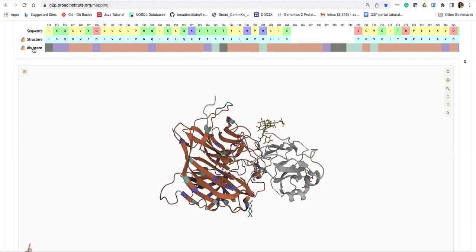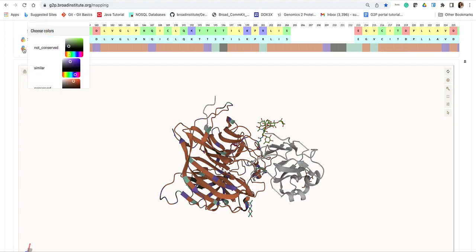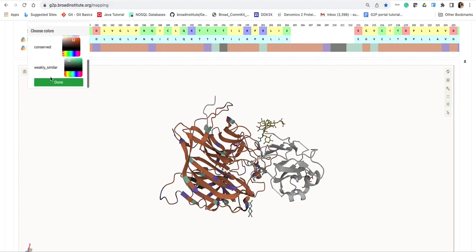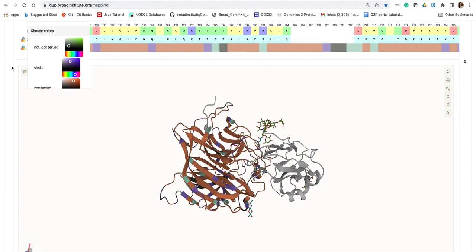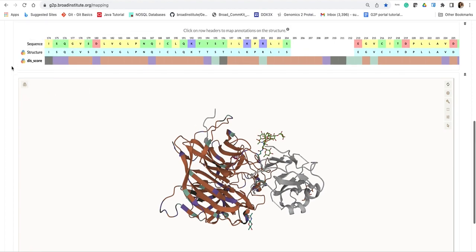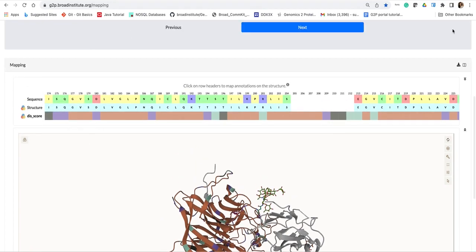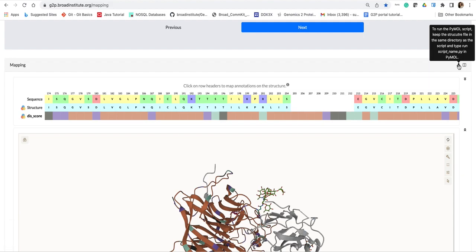To view it onto the structure, hit on the row header and from here you can also change the color that you want to view your different conservation residues of different conservation levels. But instead, what I will do is go ahead and download the annotated structure to investigate it locally using PyMOL.